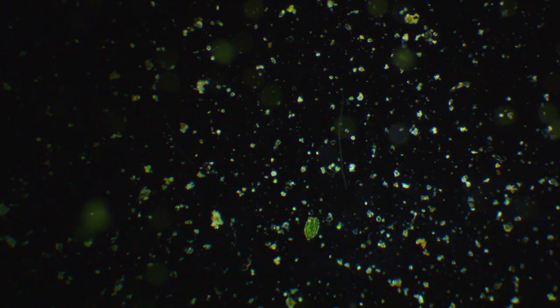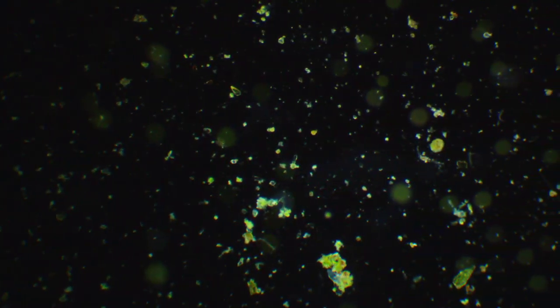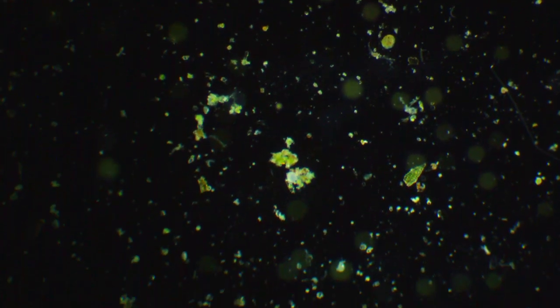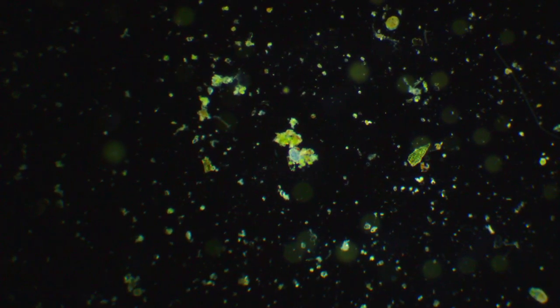So this here is some moss that was growing on a big tree. The moss was growing on the north side of the tree. Some fuzzy green moss. And I just took some of it, put it in a test tube, and then put some distilled water in the test tube, and let it sit there for about 5 hours. And started a stream. There's another rotifer, looks like.